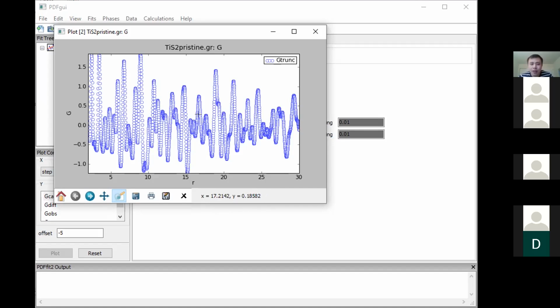But another important thing is coming from the instrument, because the instrument itself actually has limited resolution. In here, the resolution we're talking about is actually how well the XRD peaks are resolved. We still remember PDF comes from the XRD. That's why we do the integration, right? We measure the diffraction data, and then we move on to the R range.